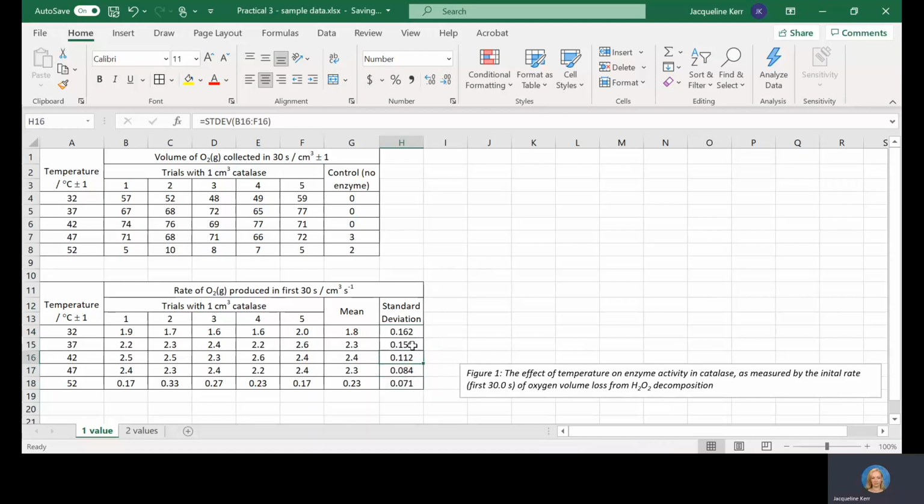So again, you're going to have to do some of them individually so that they've all got two significant figures. Okay, it's time to plot our graph. Both these tables, by the way, you would put into your Word document to show the raw data you collected and the processing that's occurred. You should put a heading at the top of each one.